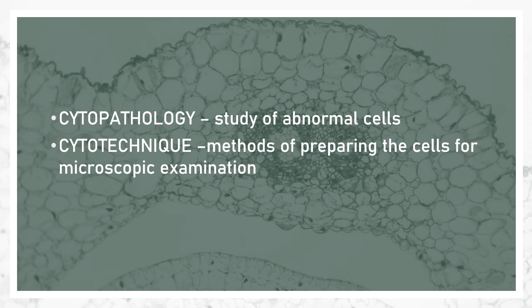In cytotechnique, you have smear preparation, fixation, staining, and the rest of the techniques involved. This is just the same as histopathology and histopathologic techniques.